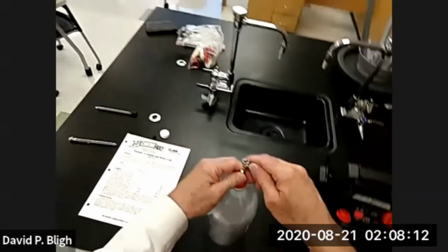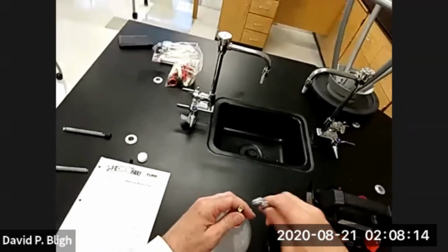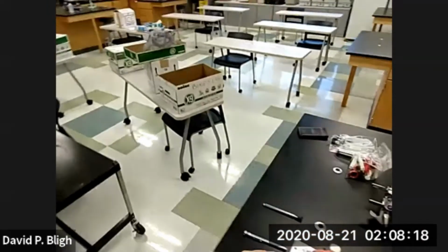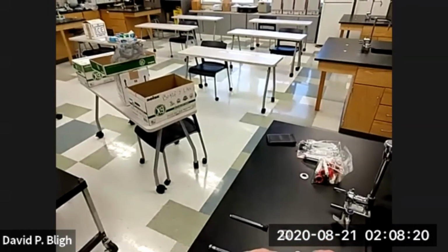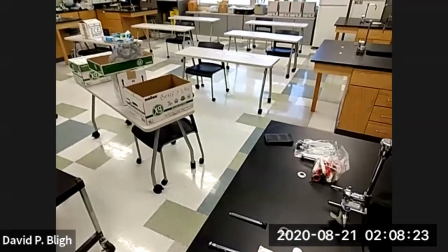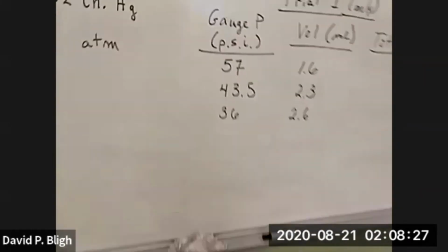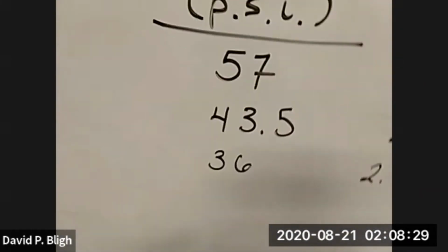All right. And measure the pressure, which is now 25 and a half PSI.